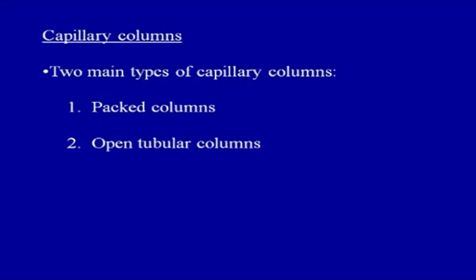Now, there are two types of capillary columns, and these could be packed columns or open tubular columns. When you say packed, these have solid particles over the whole diameter of the column, like we have seen in packed columns, but open tubular columns are different.